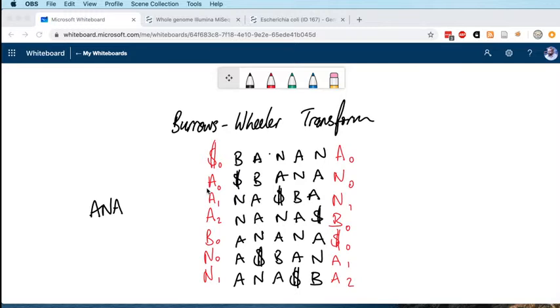So to find candidate regions where you may have a match to your read, all of those candidates are then expanded using a slightly more refined alignment algorithm. Bowtie2 in particular uses the Smith-Waterman algorithm, a pairwise sequence alignment, dynamic programming algorithm, which goes back to the 80s. It's been around a long time, but that's then used to enable you to find the best overall alignment for your read sequence to your reference genome.